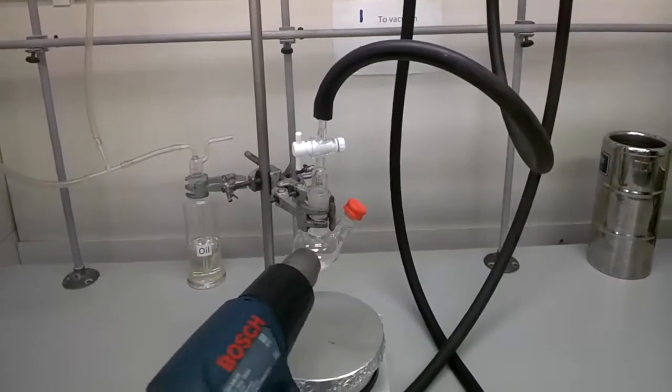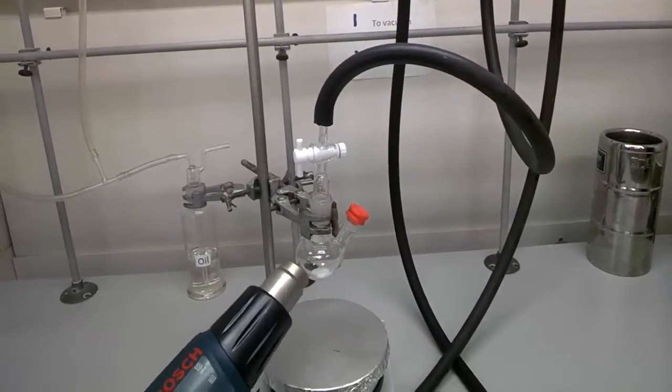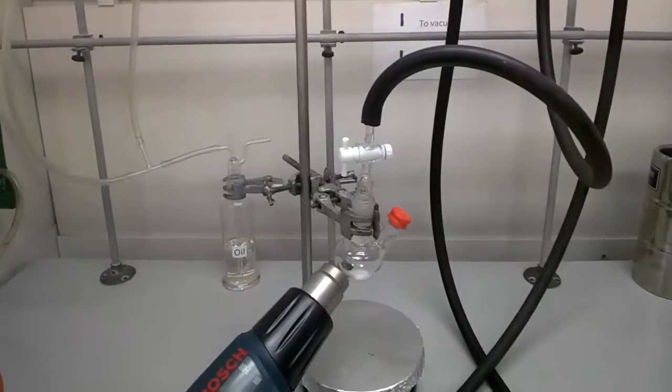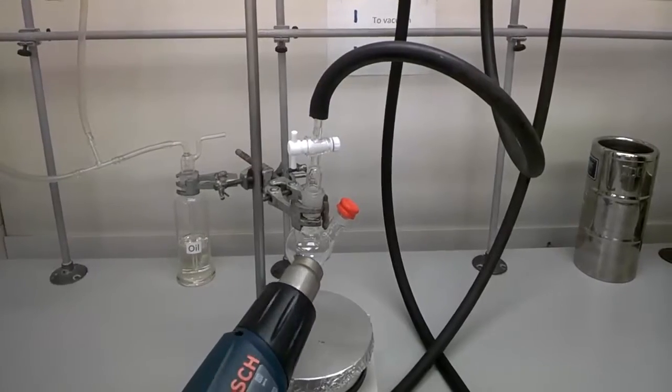Pay attention not to have the heat gun blowing hot air onto the rubber septum because it might melt and contaminate your glassware. Never put your finger near the heat gun as it might cause injury.